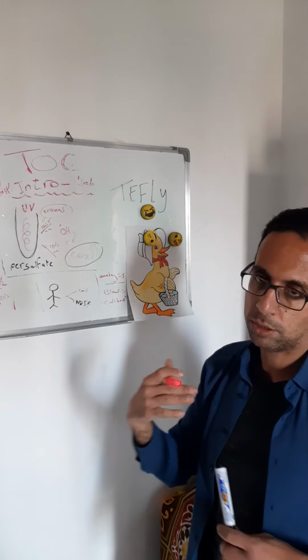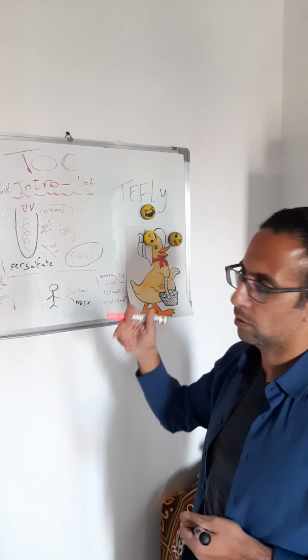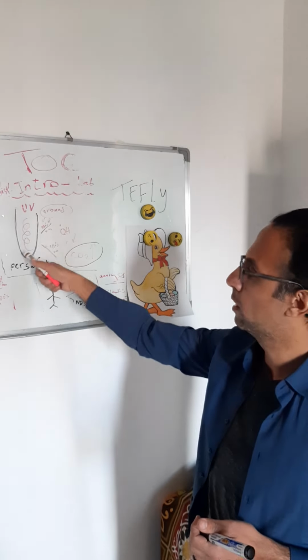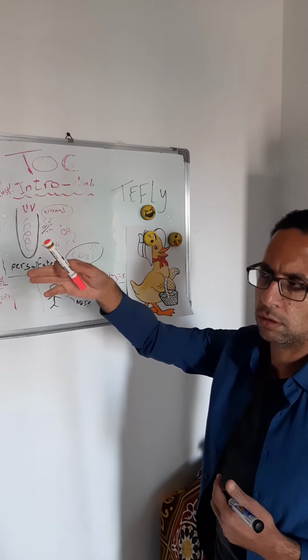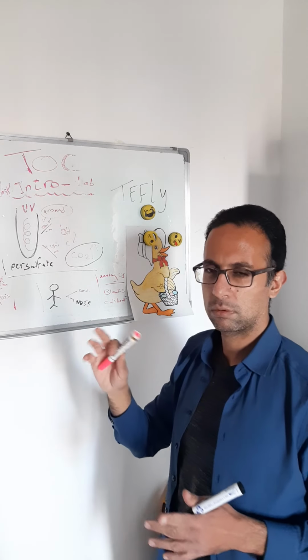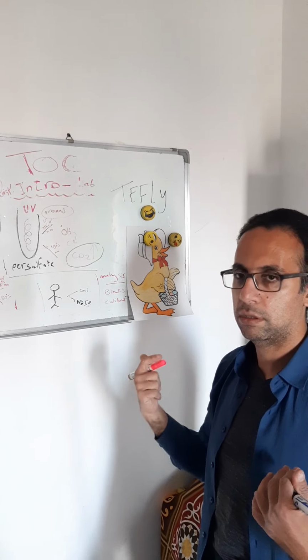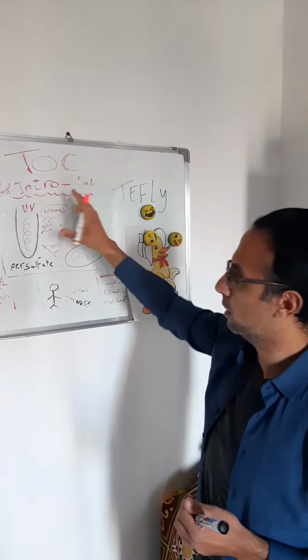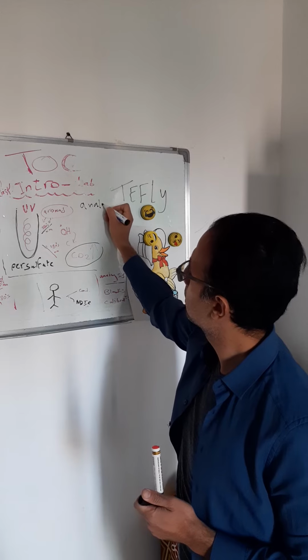There are many types of TOC analyzers, as I said, famous ones, and we'll talk now about detectors. The main difference is usually in this analysis step. Some instruments use UV, as I explained, but some instruments use combustion. Actually, I think these are the two main ways. I'm not sure if there are newer ways or older ways that are not used now. But the main ones are UV and combustion for analysis. This is the analysis stage.